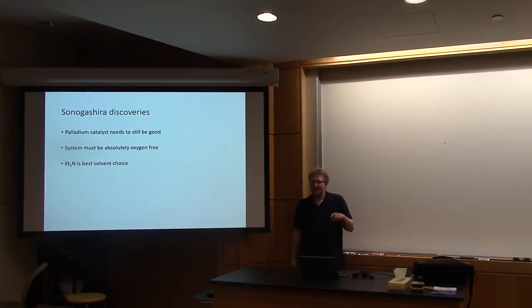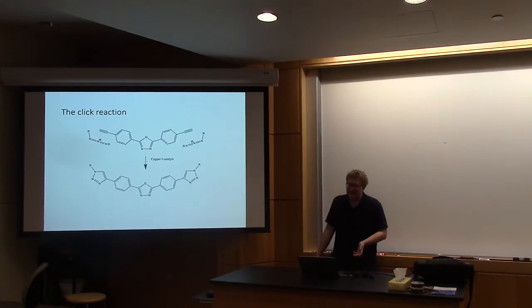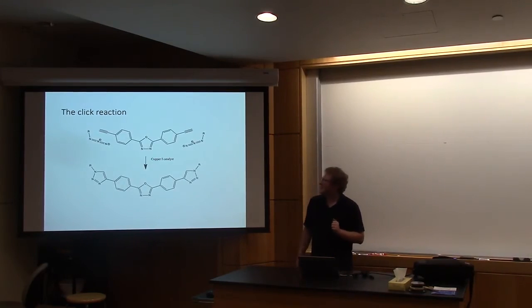All right, so success. We've gotten through our Sonogashira. Now comes the step that I never got to work. Yay! Here we have the click reaction. Well studied. Very easy to get to work, right?